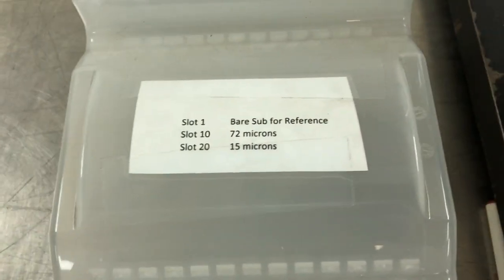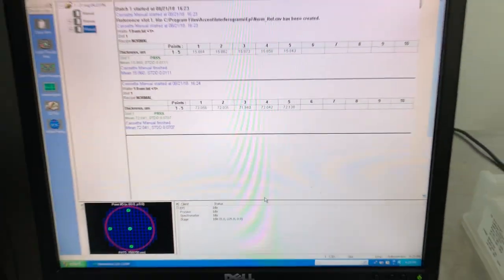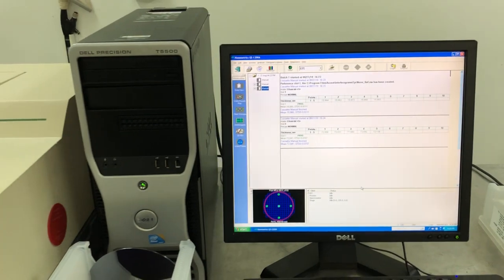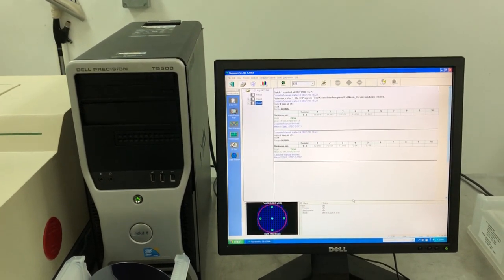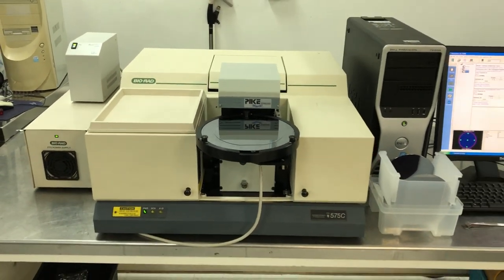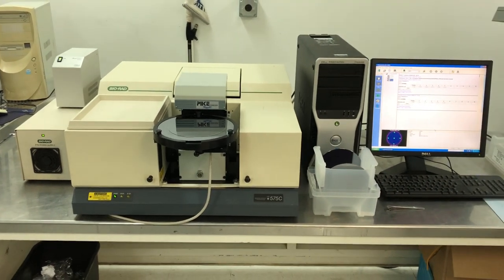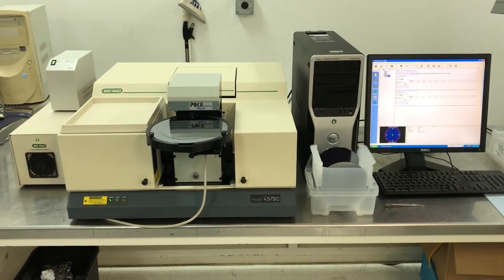These are the wafers we received from an epi house to help us with our epi thickness testing. That's the demo of the system running epi thickness with the pike stage and no purge box.